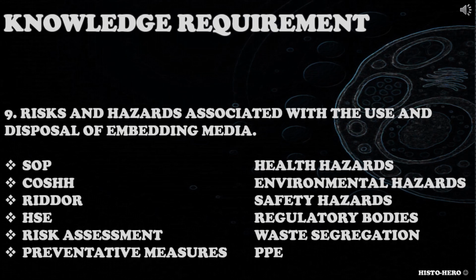The ninth knowledge requirement is risks and hazards associated with the use and disposal of embedding media. Candidate needs to have the knowledge and understanding about the risks and hazards associated with embedding media. You could ask the candidate to name the risks and hazards associated with the use and disposal of embedding media used in your lab, explain how they would mitigate those risks and hazards, and what preventive measures they apply when using and disposing embedding media.